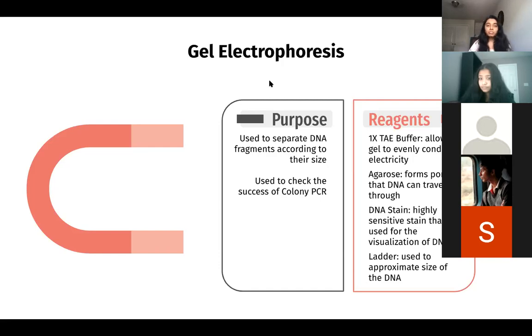Okay, sounds good. So essentially the difference between the two, Manasvi, please interrupt if I am incorrect, is that regular PCR amplifies strands of DNA alone. And in colony PCR, we are amplifying cells that already have DNA in them. So in both of them, we are amplifying DNA sequences. Just in traditional PCR, it's just the DNA alone, whereas in colony PCR, the DNA is already inside of a cell. So was that helpful? Yeah, thank you. Of course. And guys, feel free to interrupt me if you have any questions.